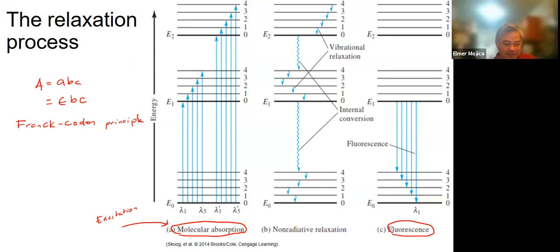So this Franck-Condon principle just means that the absorption process takes place on a time scale of 10 to the -15 seconds. And this is much faster than what we call the molecular vibration. So ito yung inaano natin, okay, if we have this so-called absorption process. So this is much faster than the molecular vibration, which we're going to talk about after this module.